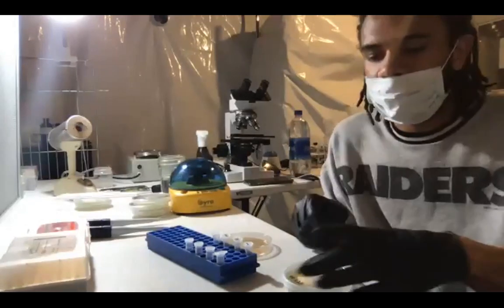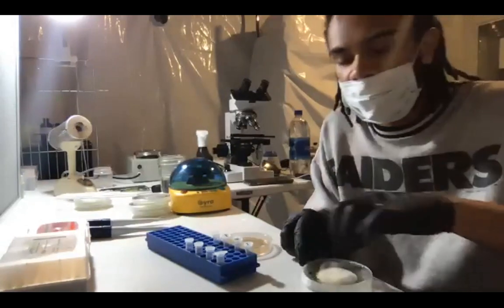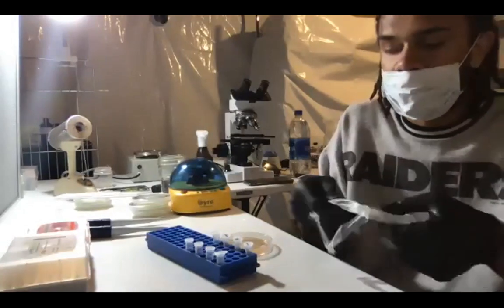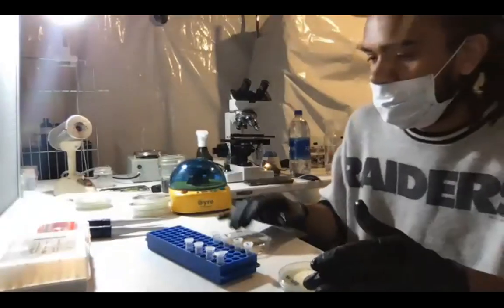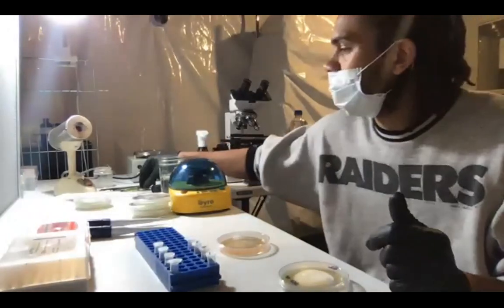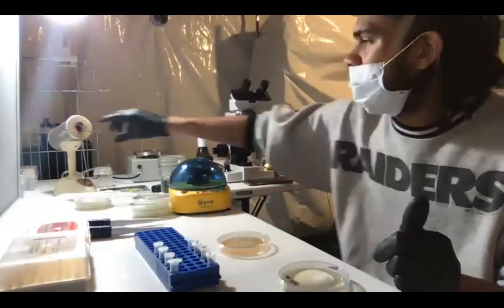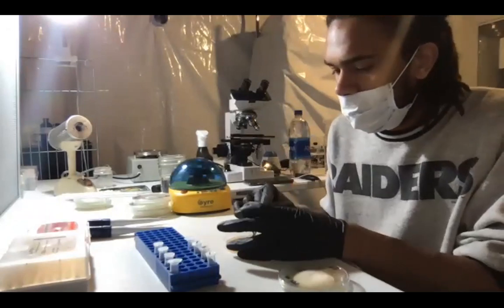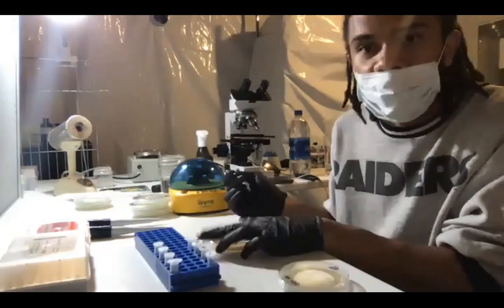When you're breeding a lot, this takes a long time if you have a small PCR. So definitely check out the Odin, because they sell used PCRs sometimes, and you can get a bigger one. There's some that can hold up to 100 reactions at a time, which would be great, so I wouldn't have to do this so many times. But if I get another one that has 16, then I have another 8, then I can do way more at a time. If you're doing a lot of breeding projects, you're going to end up doing a lot of this.